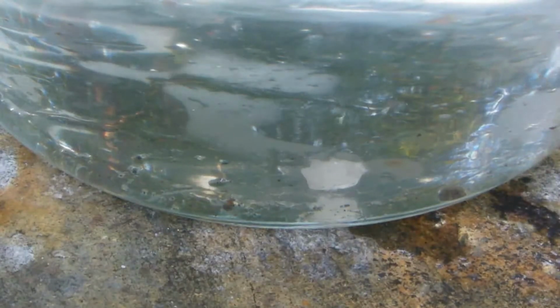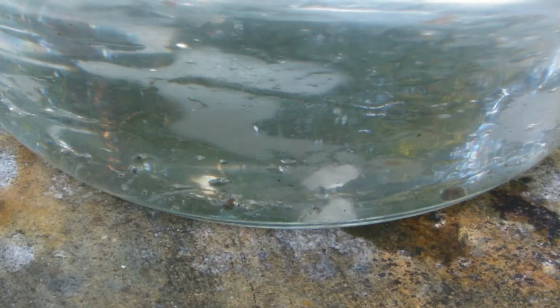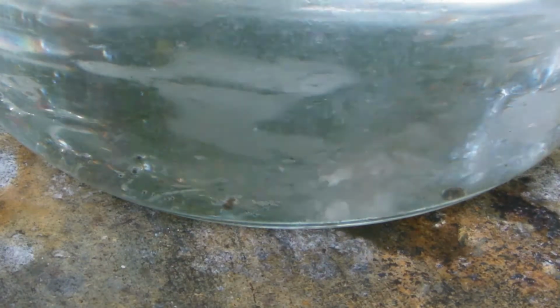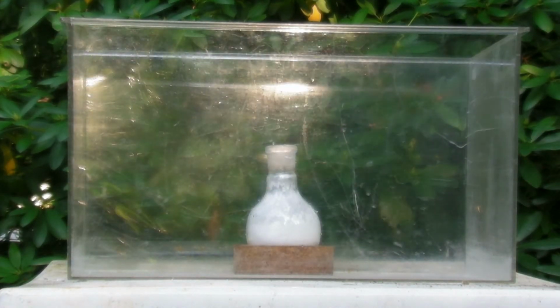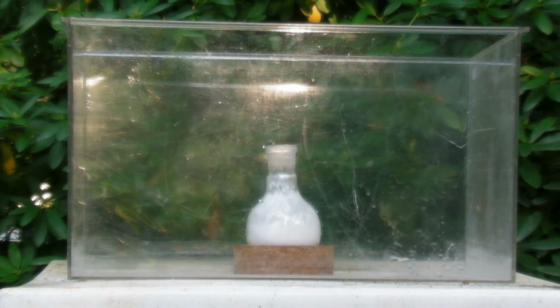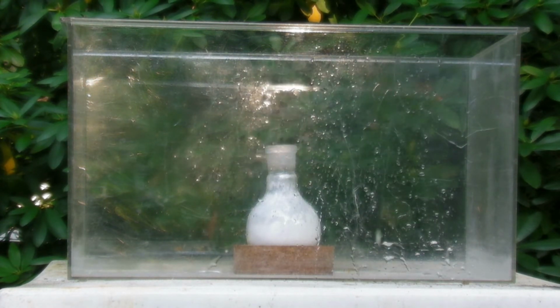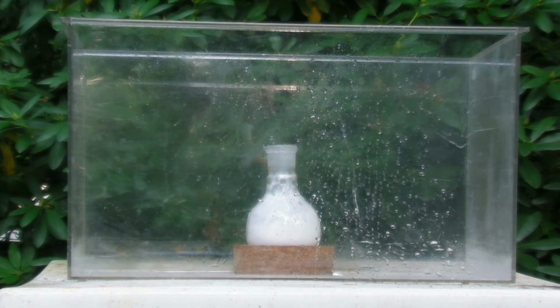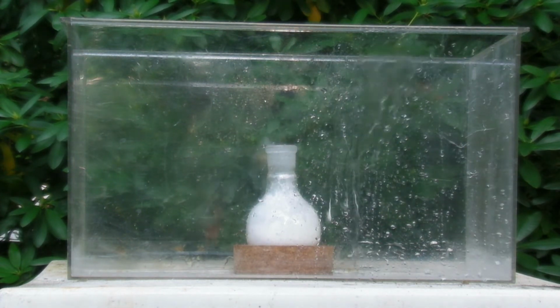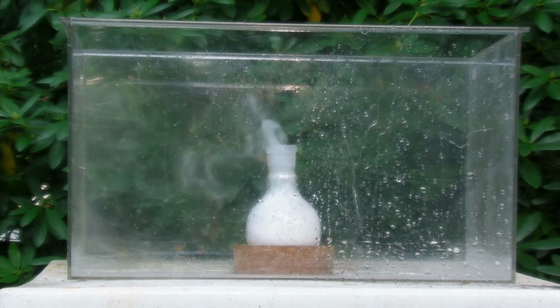Another sample reacted slowly, which is why I decided to try treating the mass with water. The flask was placed in a plastic container to collect the acid if the flask breaks. In addition to that, it would have been a shatter protection in the worst case scenario. This method is for sure not the best one, but the cheapest.